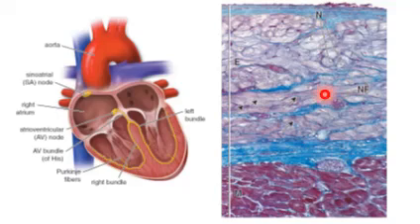We don't have lots of nuclei, and the arrowheads indicate the intercalated discs, which appear much more clear if we compare them with the cardiac muscle fiber. As I stated one minute before, it contains a large amount of glycogen, not collagen.